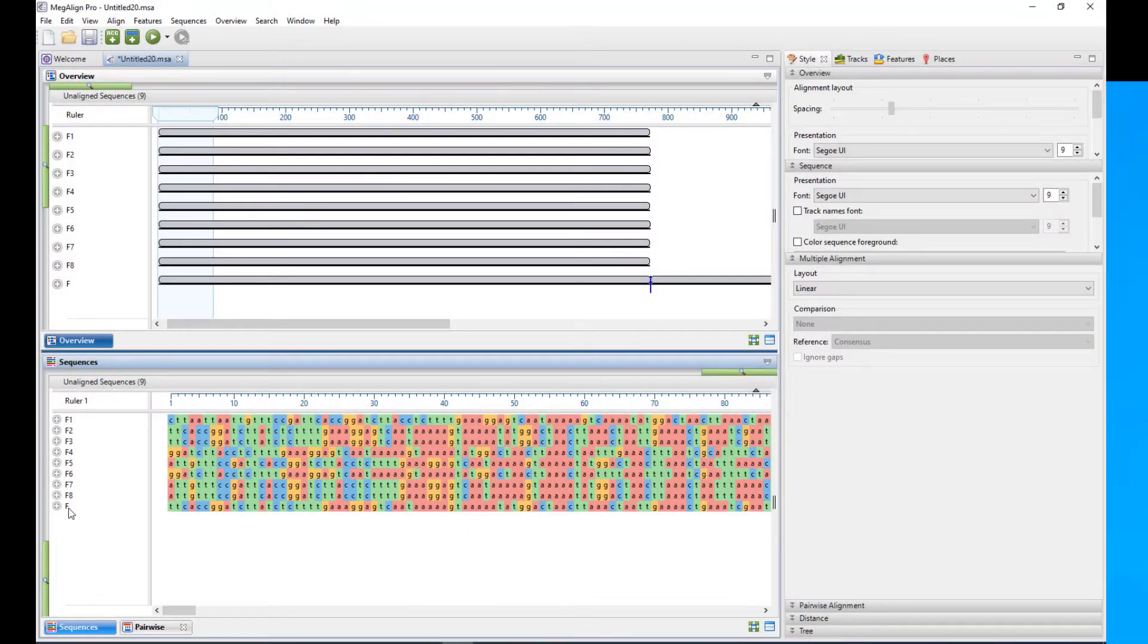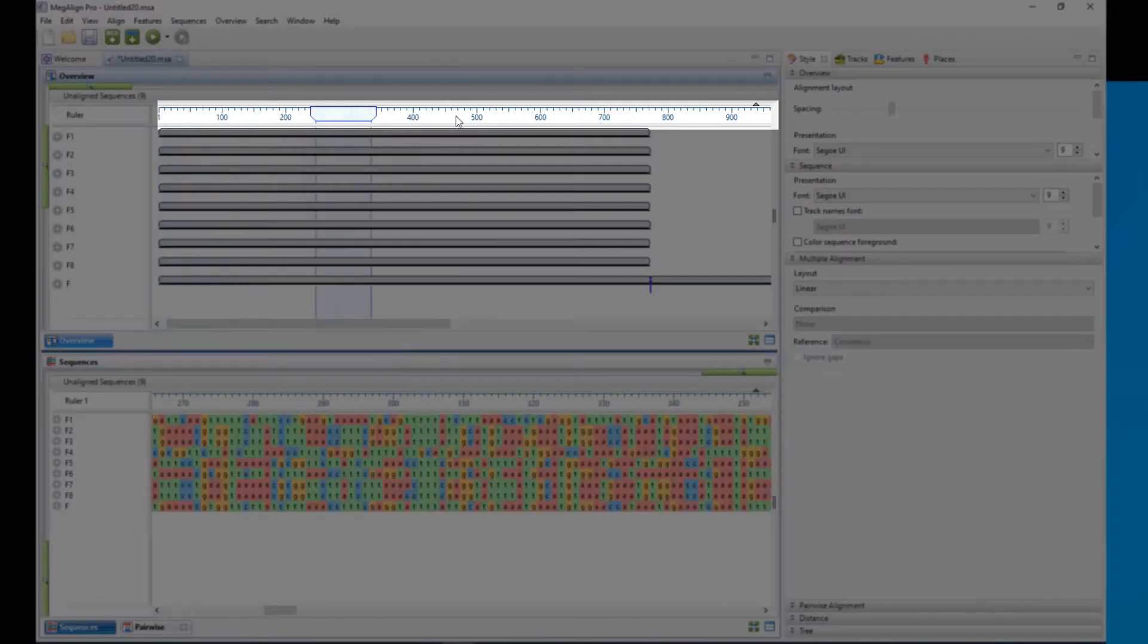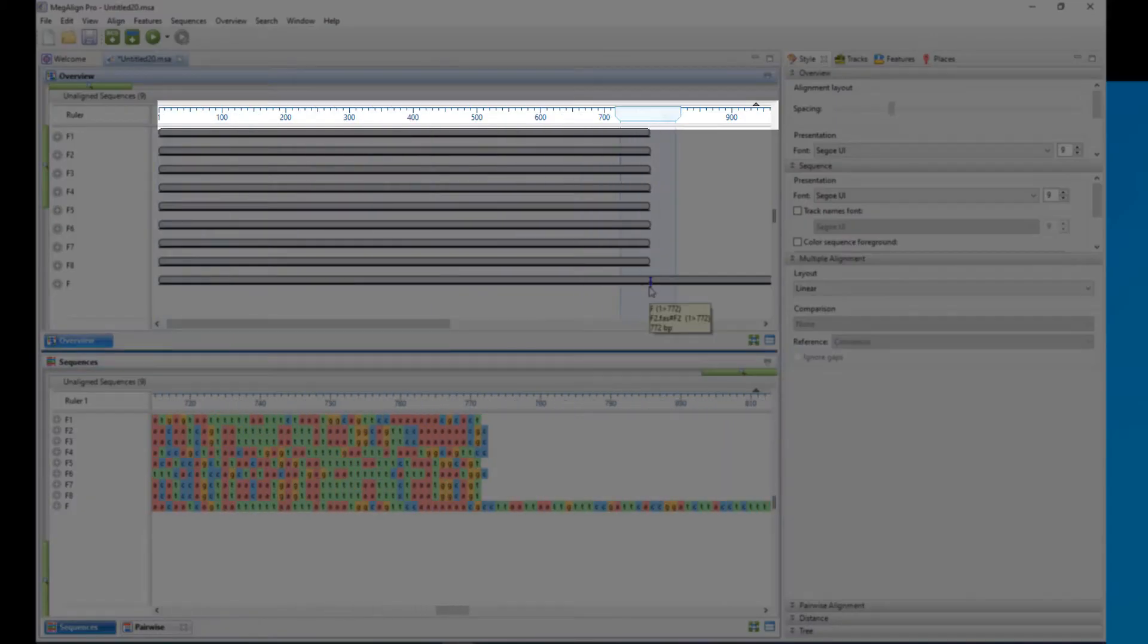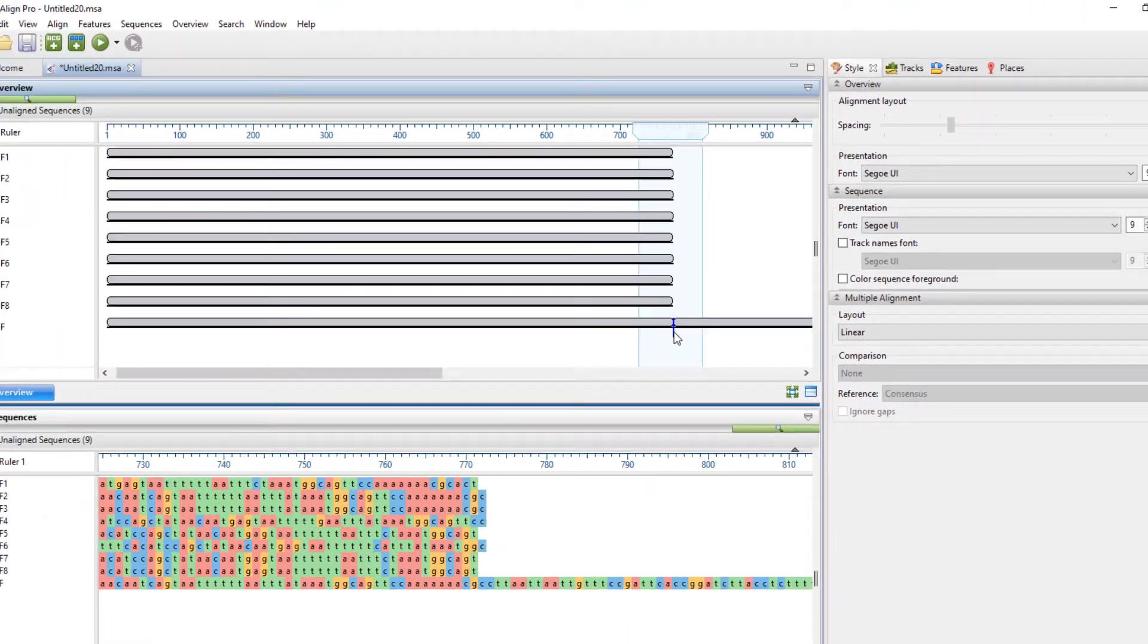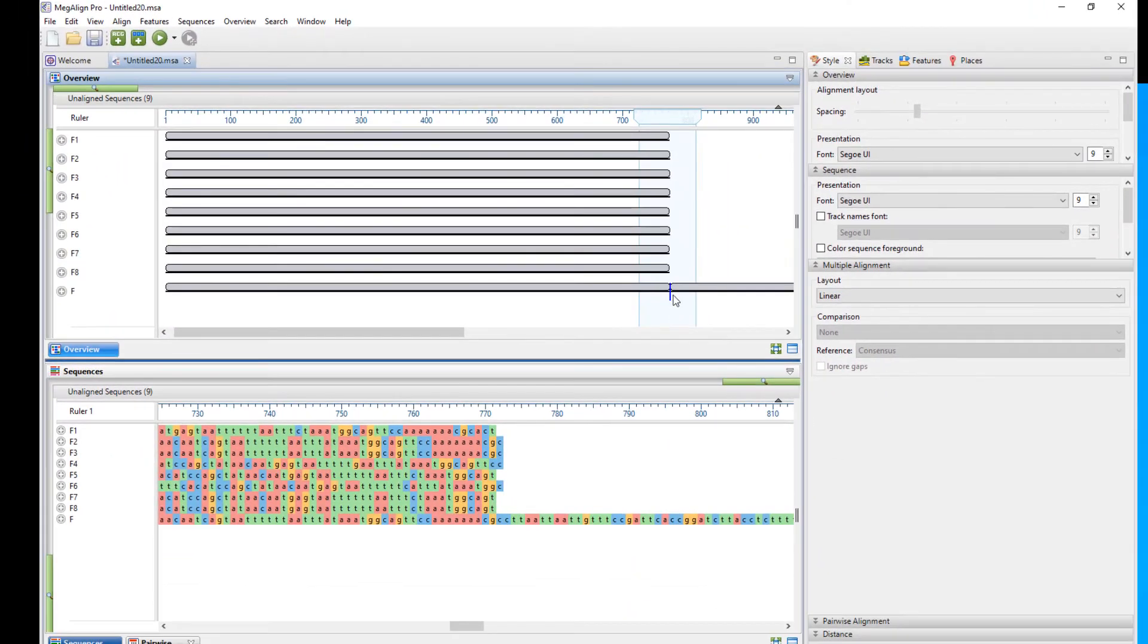So here my file was added. I just wanted to show you here in this upper pane by sliding this viewfinder, which is the lower window, I can go to that transition point. It's clearly marked on the overview.